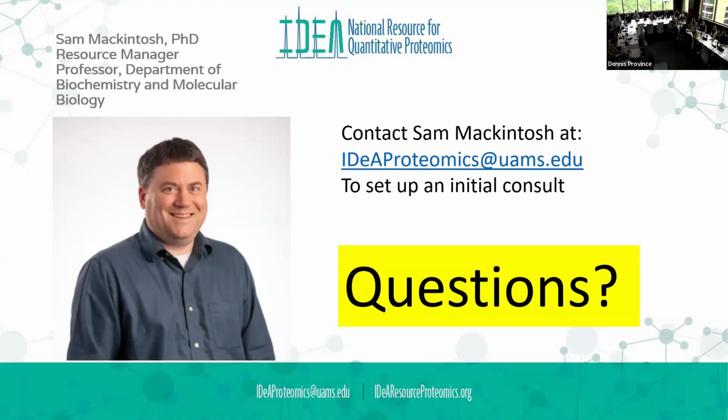Alexia, two short questions. Some proteins undergo proteolytic digestion naturally or during sample prep, and that may not be on a lysine residue. Does the database take that into account, or will those peptides be lost? Does it take into account cleavage that is not on a lysine or arginine?